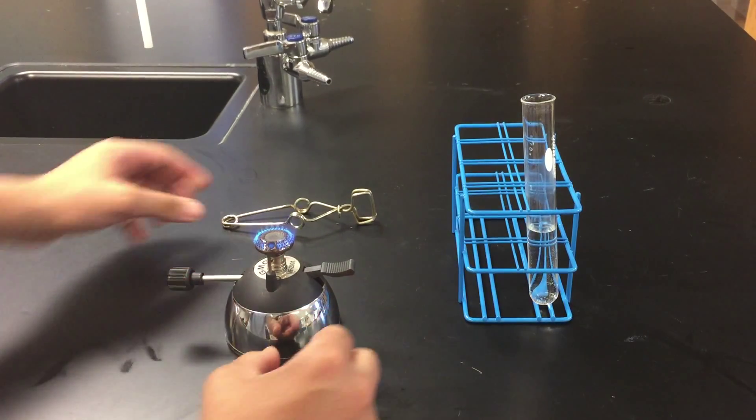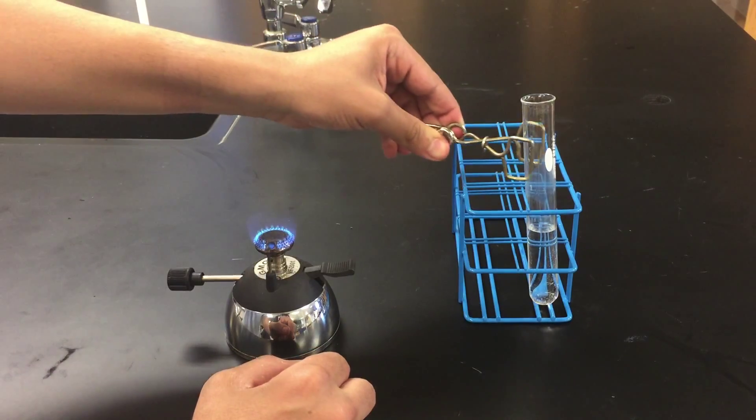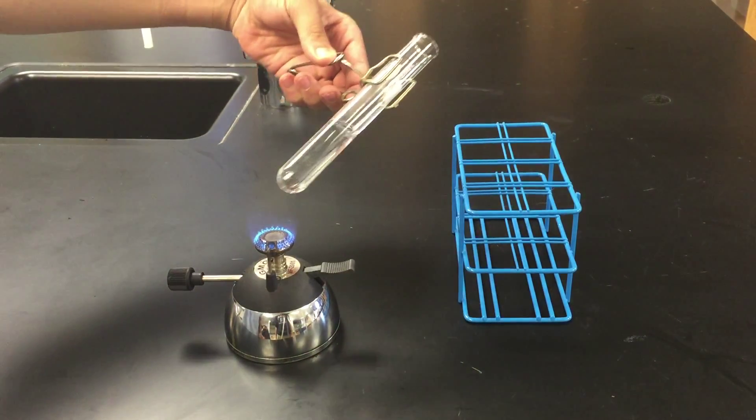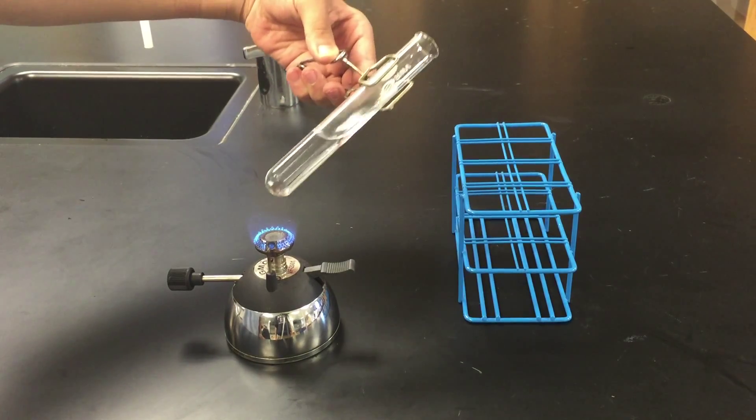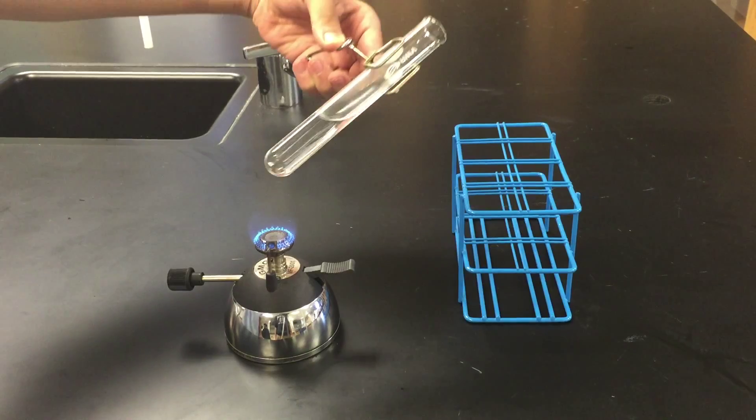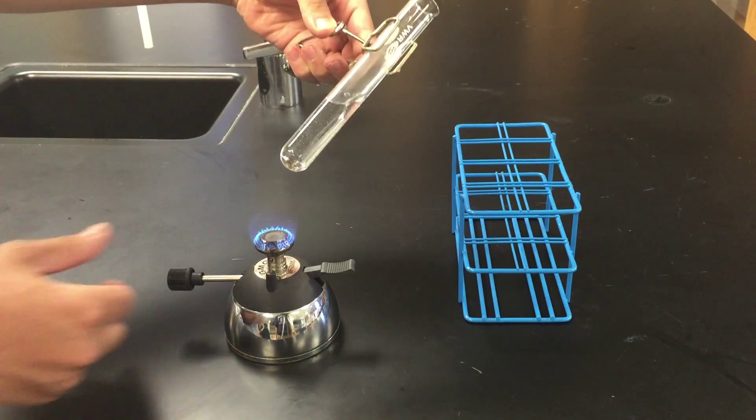Take the test tube with the clamp and hold it above the flame. Make sure to point the test tube away from you so that any vapors don't go towards you. Also, gently shake the test tube to mix the liquid. This prevents part of the liquid from superheating and splattering out.